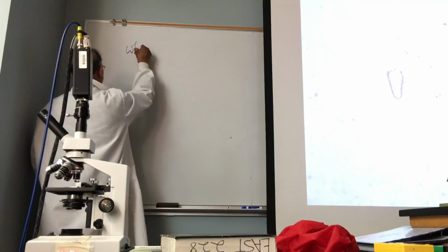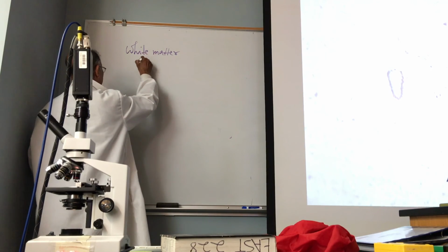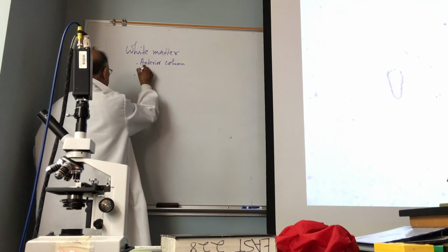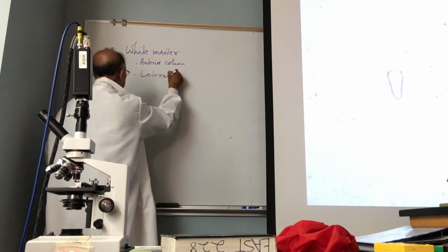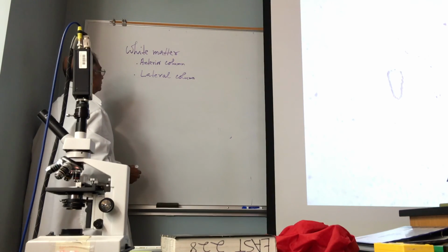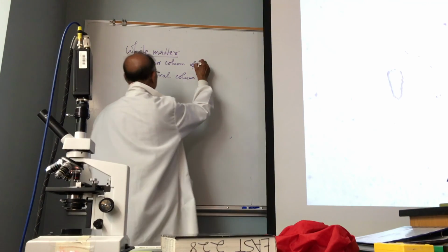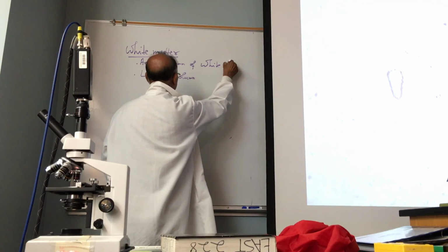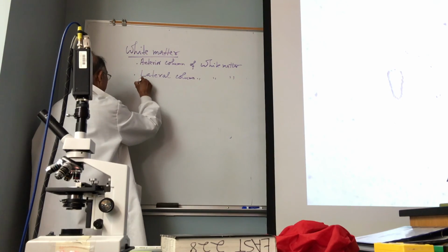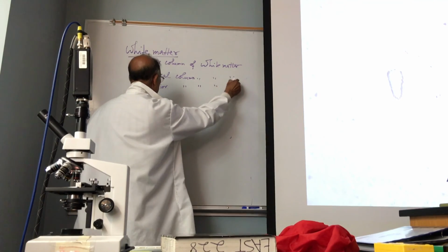White matter. Anterior column. Lateral column of white matter. Posterior column of white matter.